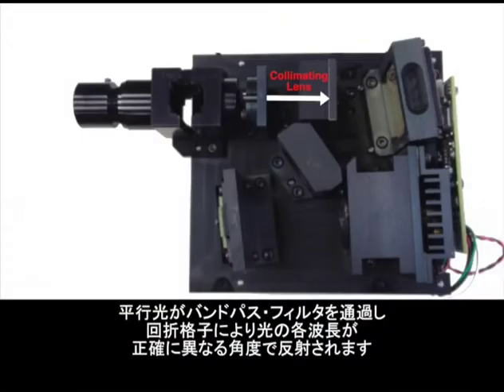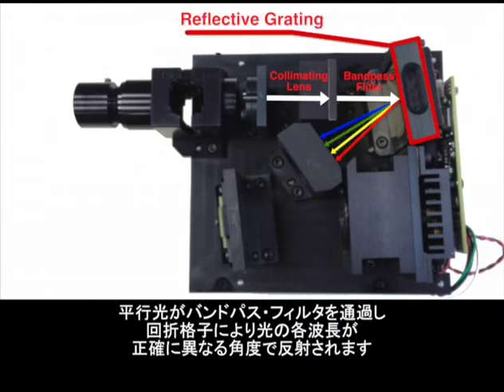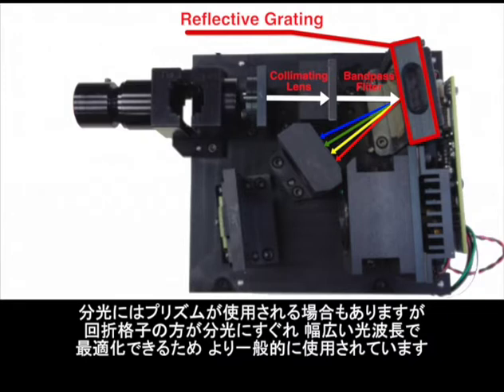Collimated light passes a bandpass filter, and the diffraction grating reflects each of the wavelengths of light at precisely different angles. Prisms are sometimes used for dispersion, but diffraction gratings are more commonly employed because of their higher dispersion and their ability to be optimized for a wide range of optical wavelengths. Either reflective or transmissive diffraction gratings can be used, and the wavelength range of the gratings determine the acquired spectrum and types of materials that can be scanned.